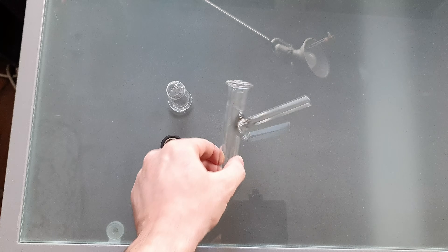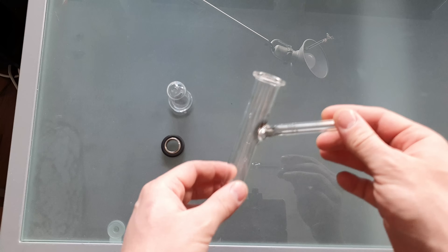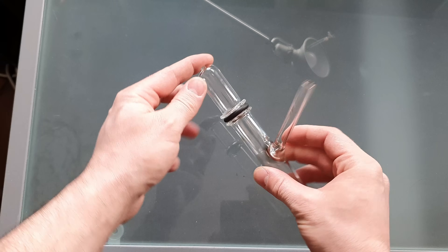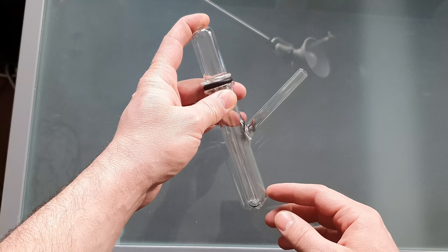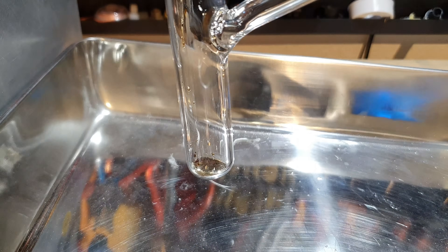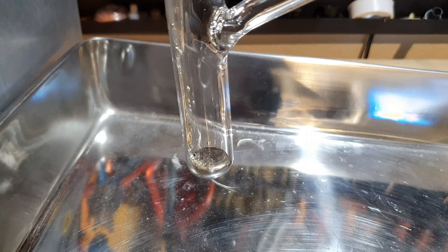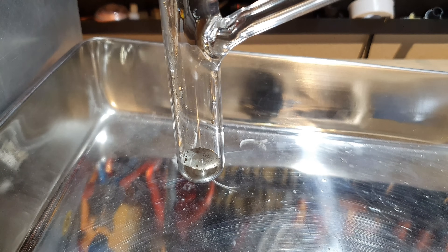I'm going to use this reaction vessel to collect the cesium that we're going to make today. And after that, I'm going to fill it with argon and seal it with this KF flange that I made. Then I'm going to pull a vacuum on it and slowly add oxygen to oxidize the cesium inside. I added cesium chloride and lithium to my still, closed it up, flushed it with argon, pulled a vacuum and started the distillation.